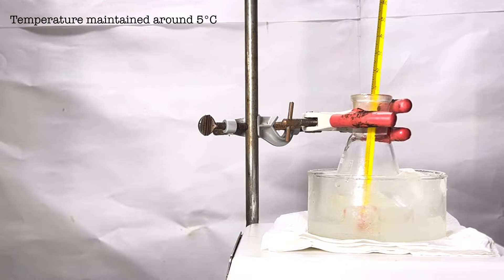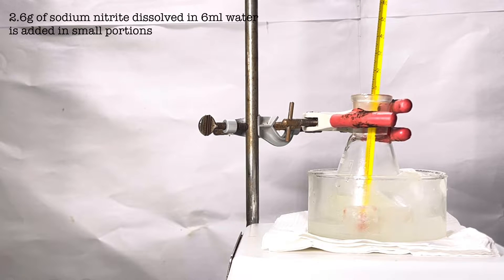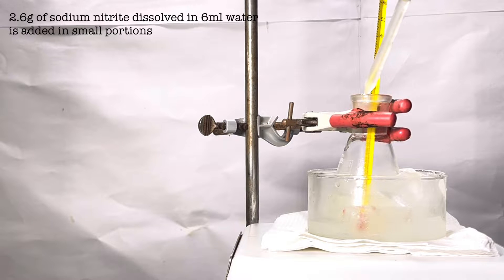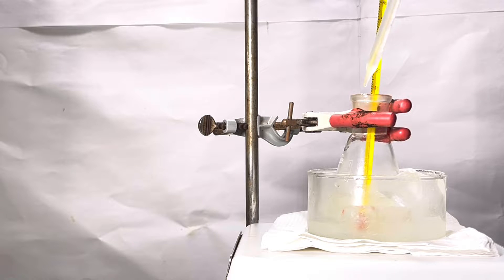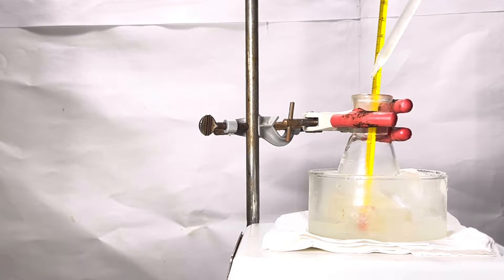chilled sodium nitrite solution containing 2.6 grams of it in 6 ml of water is added in small portions using a glass pipette. A very keen eye has to be kept on the thermometer as the temperature should not rise above 10 degrees C. This could result in the formation of tarry unwanted side products.